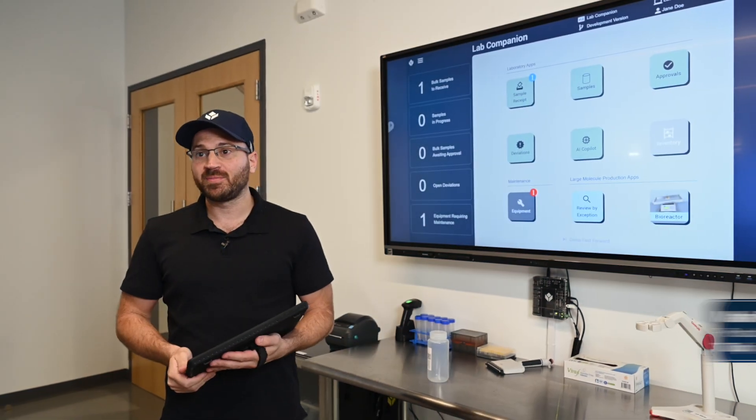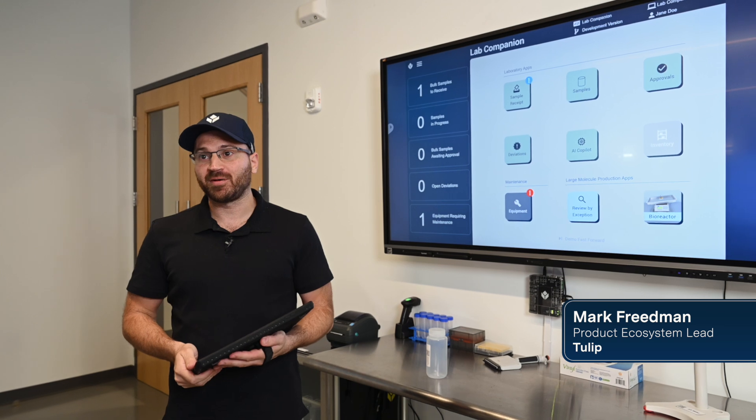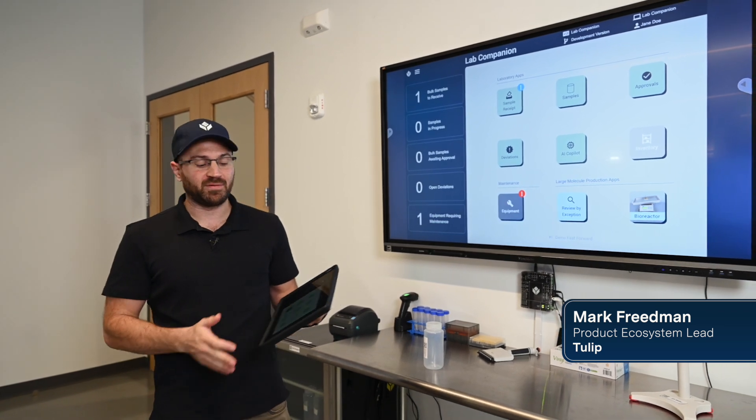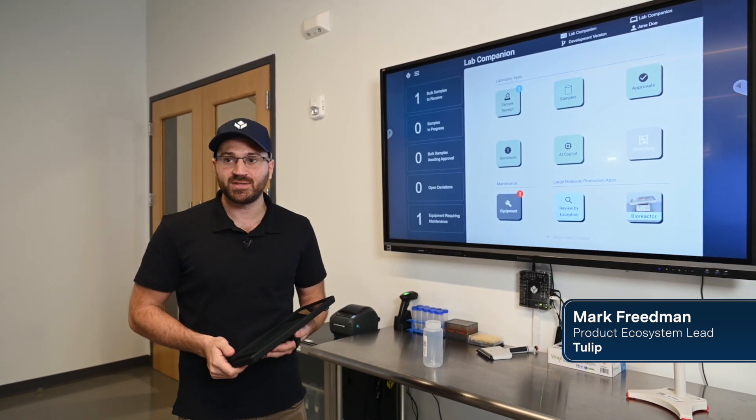Hey everybody, welcome to the Tulip Experience Center. My name is Mark Friedman and I'm going to show you an example of a laboratory management system.